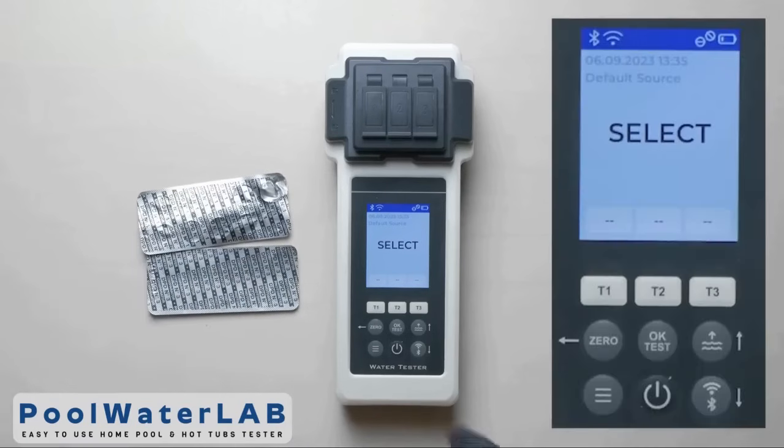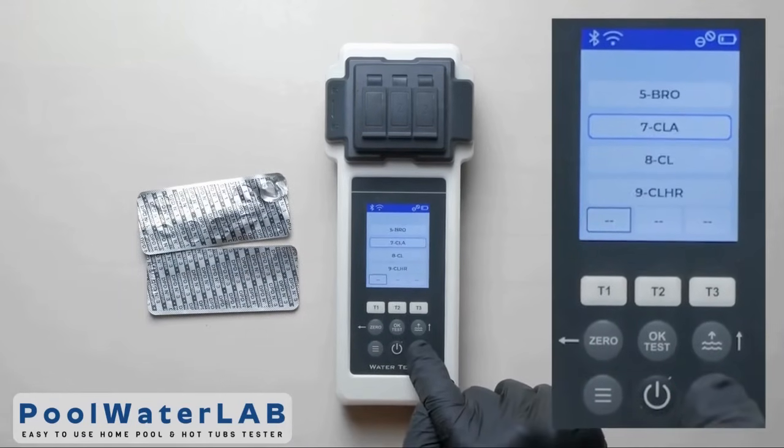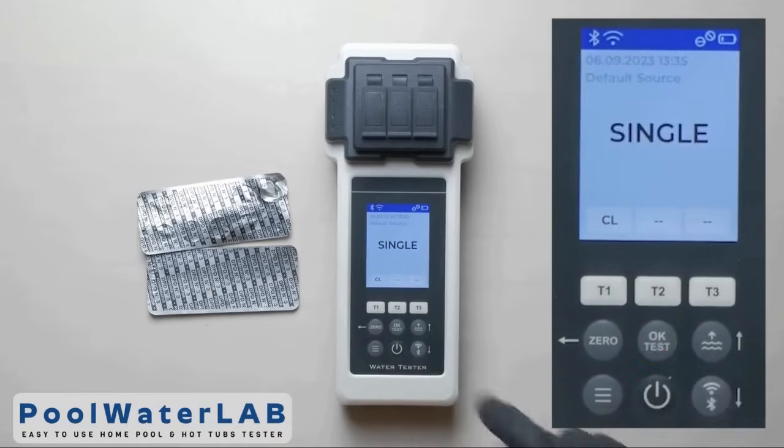Press the T1 button to go to the menu. Use the up and down buttons to select the desired parameter, then click OK.